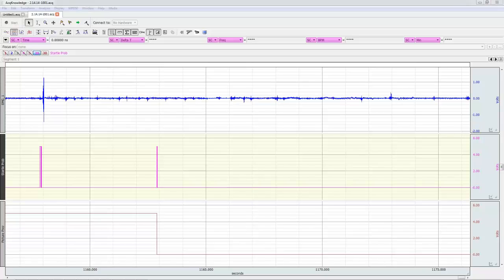Okay, and you'll notice with your EMG data here that it is raw and it needs to be rectified and smoothed prior to analysis. But before that, we're going to apply some bandpass filtering and also 60-notch filtering. 60 Hertz notch filtering to remove electrical noise that's not part of your biological data. So let's start with our bandpass.